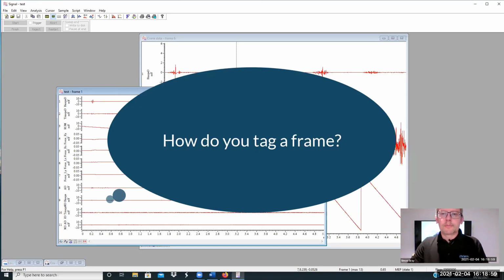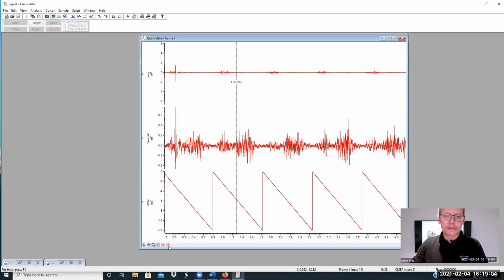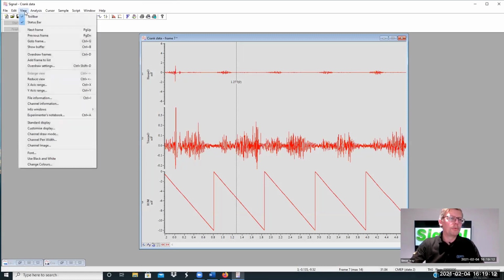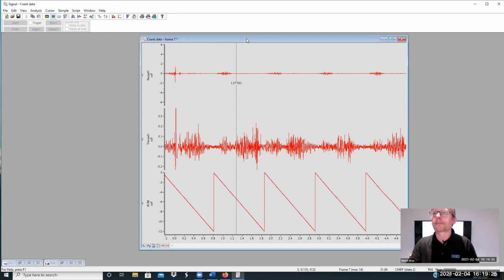Right, sorry, I did miss that. Tagging a frame. Stepping left, stepping right, page up, page down. Control T to tag. View, and you should have, right, Control T. There is a list of hotkeys in the help. And I can show you that in a short time.